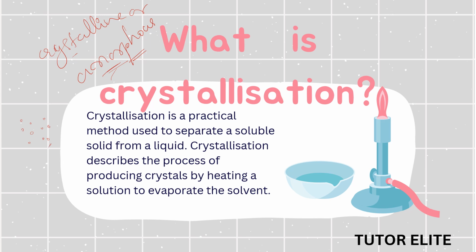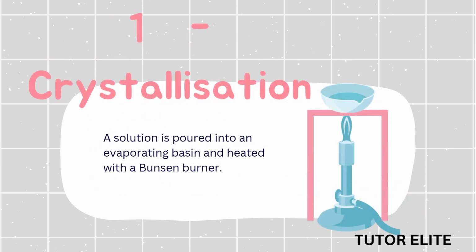Crystallization is a practical method used to separate a soluble solid from a liquid. Crystallization describes the process of producing crystals by heating a solution to evaporate the solvent. So let us see how we get them.